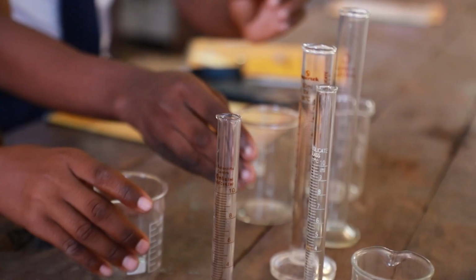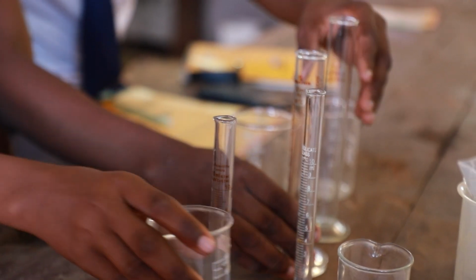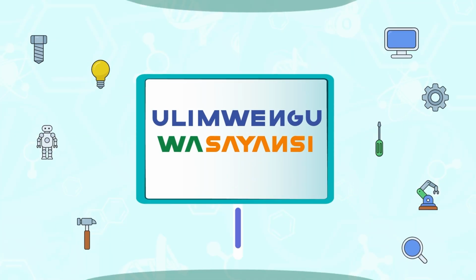So we say that as you increase the volume, the rate of chemical reaction increases, but the time decreases. So that's how concentration affects the rate of chemical reaction. Thank you and welcome to the experiment.